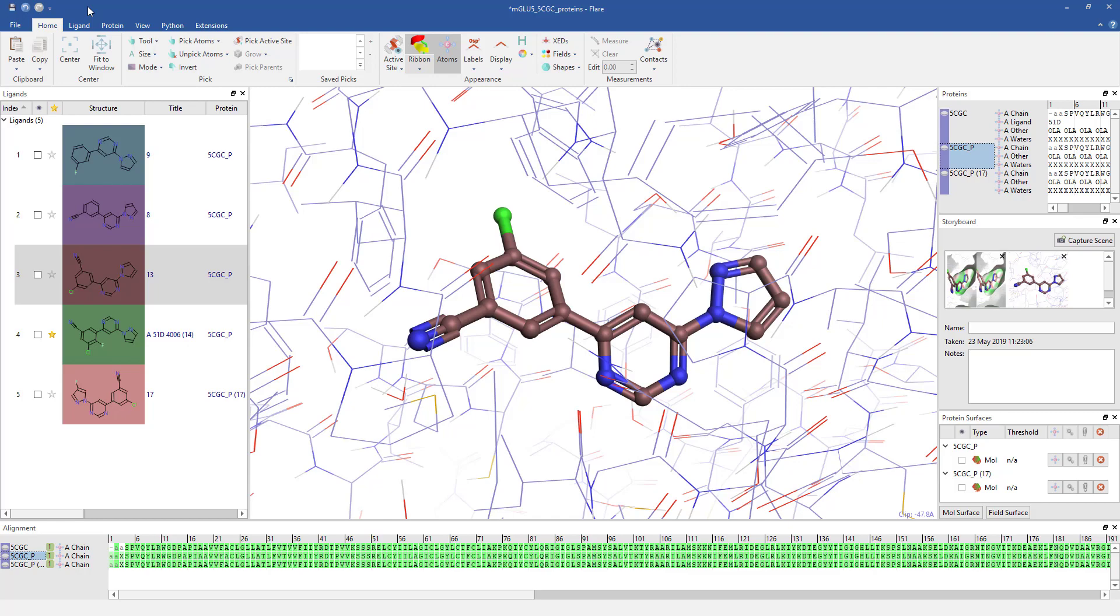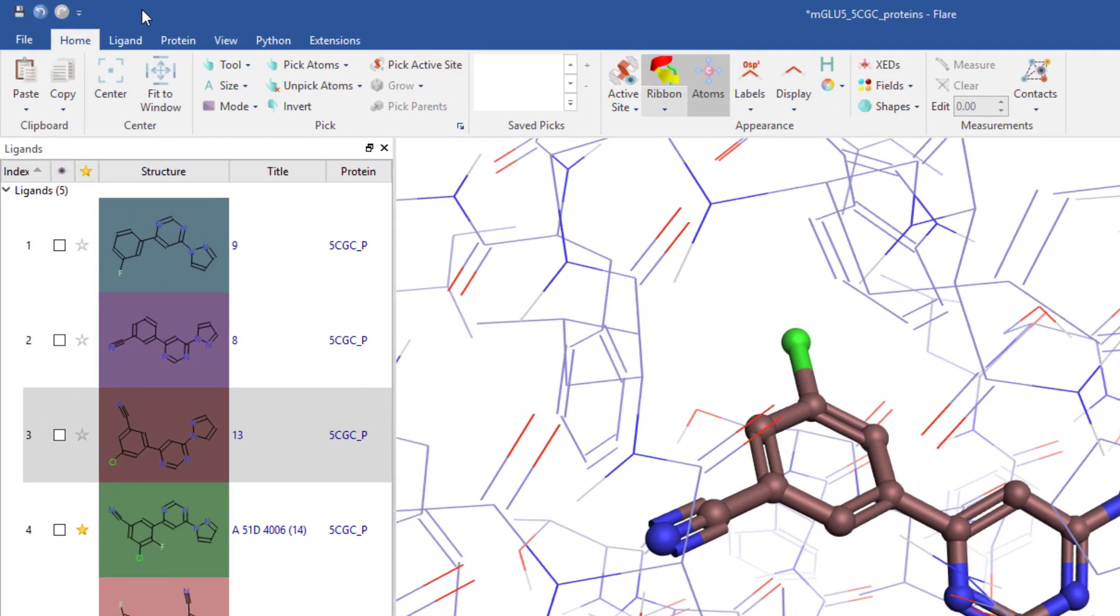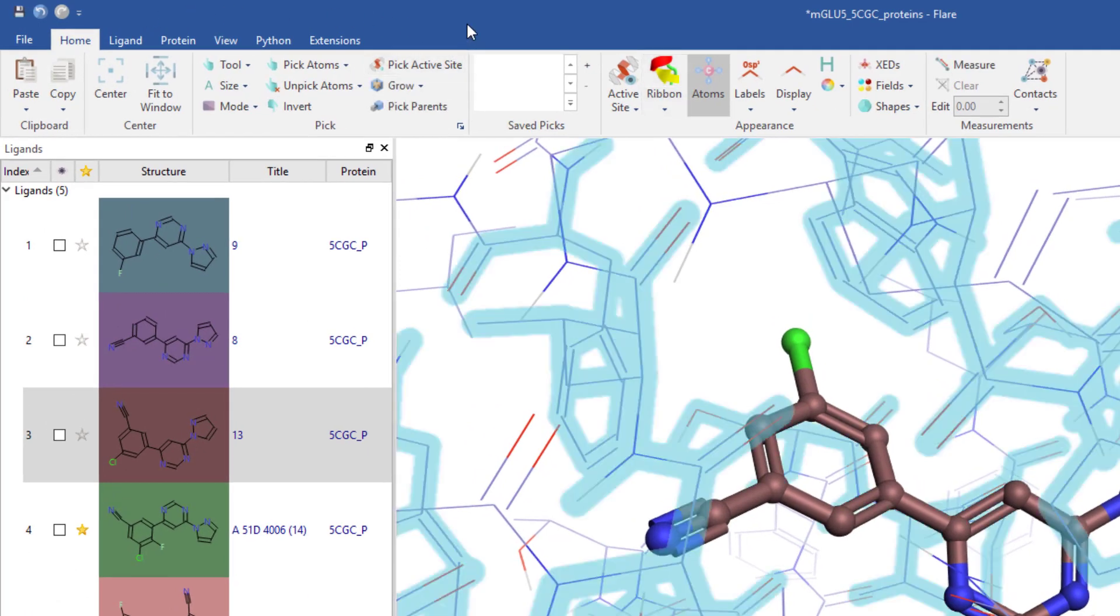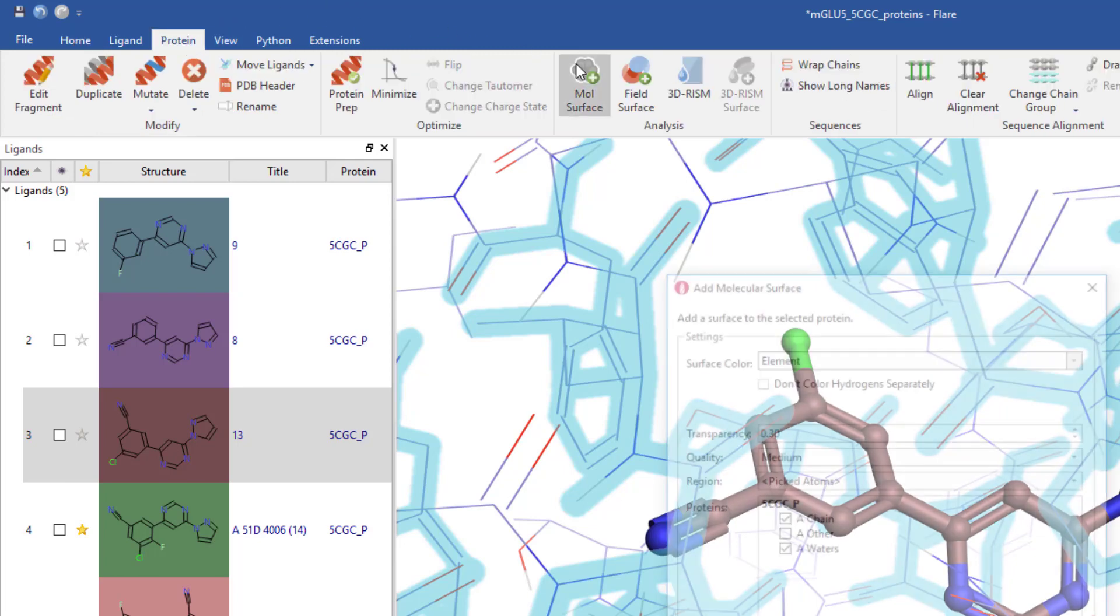Electrostatic complementarity surfaces can also be generated for proteins. I firstly need to select the protein or parts of the protein the surface should be generated on, then go to the protein tab and hit the mall surface button.